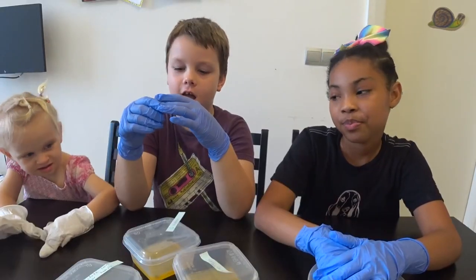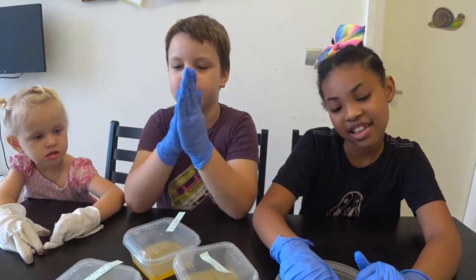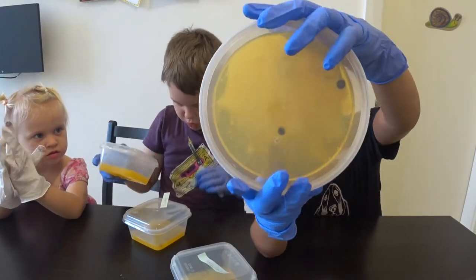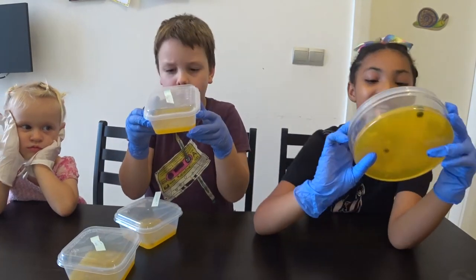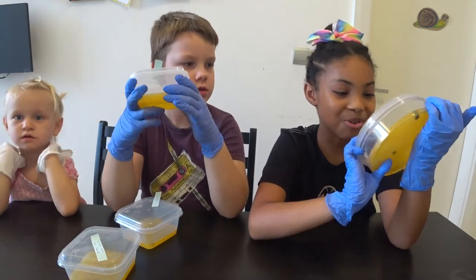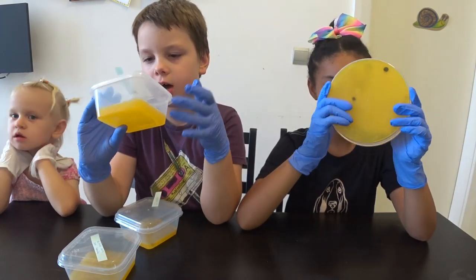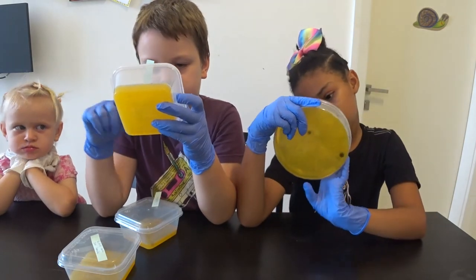And now we are going to check what is the dirtiest one in here. I think it's this one because as you can see there is some dirty dust over there, black and small and big dots. It kind of looks like a mold, and there's also some bubbles. And I think that this is the dirtiest one because it has some hair inside, like cat hair, I don't know how to say it, just hair, and it has bubbles too.